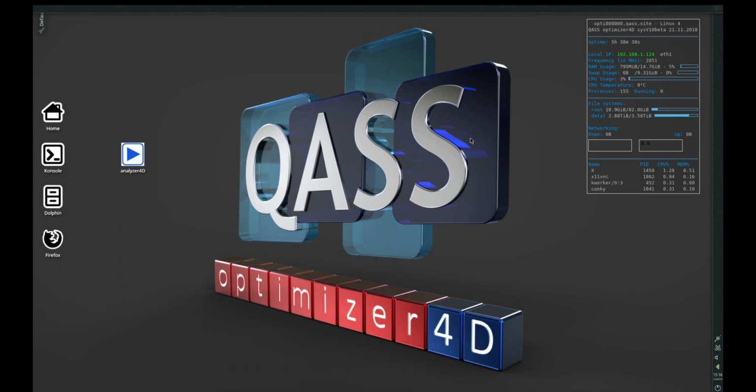So in order to start, I have started the computer, and what you see is the initial screen. Most importantly here is this area in the top right corner, where we find the IP address. So if you have your optimizer attached to a network, you can find the IP address here, and you can, for instance, access it via a different program, for instance, to configure it from the comfort of your own office.